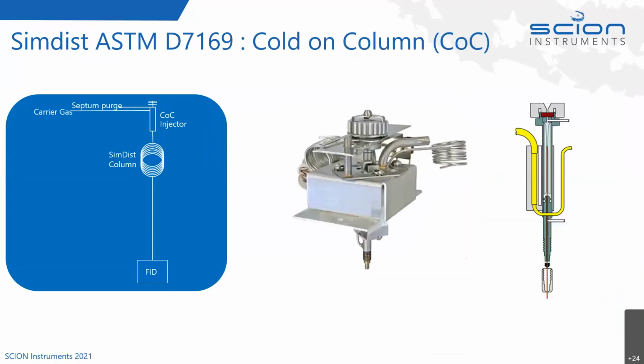So here's the injector that's used. It's a cold on column injector. There's no split involved. It doesn't have a split line fitted. It's just a very simple capillary on column injector. We're using a megabore column. You can fit 0.32 ID columns.